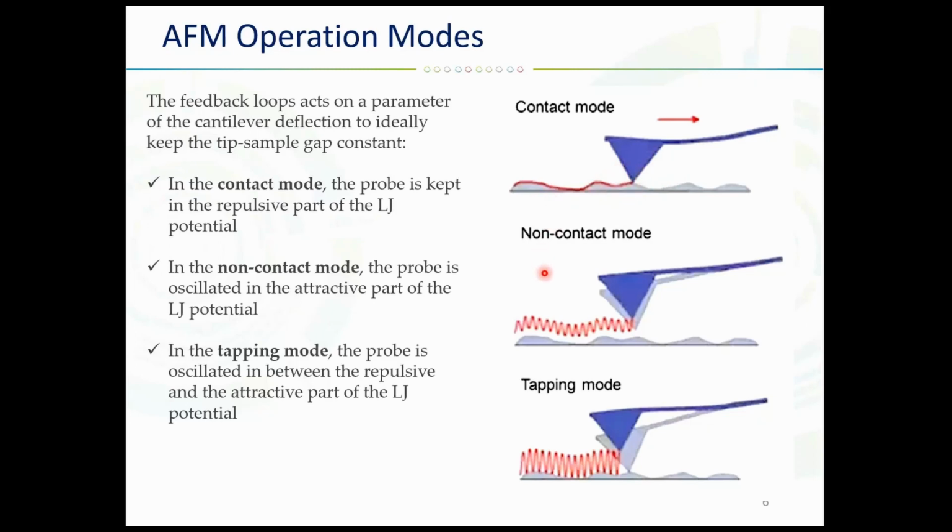So non-contact mode has a huge advantage over the contact one, because due to the oscillations of the cantilever, it decreases tip to sample forces. Meanwhile, it's still maintaining the high resolution.